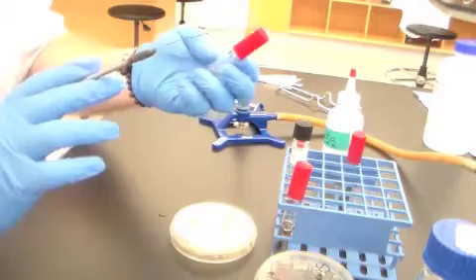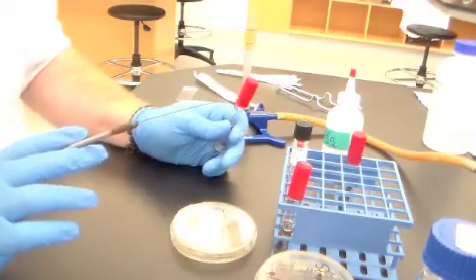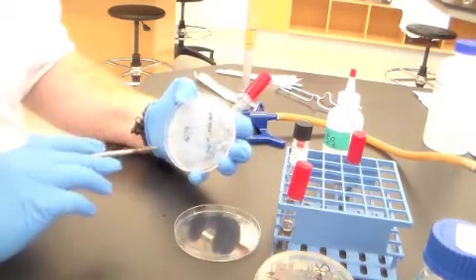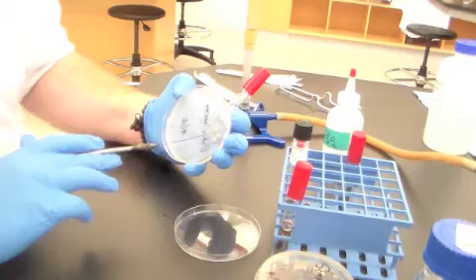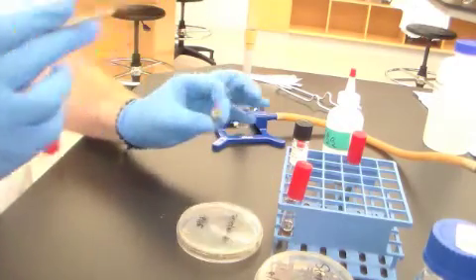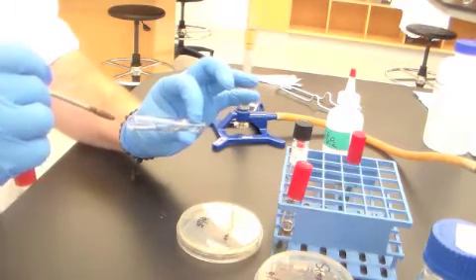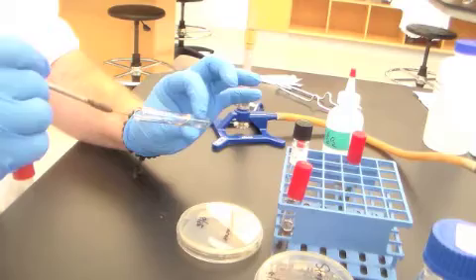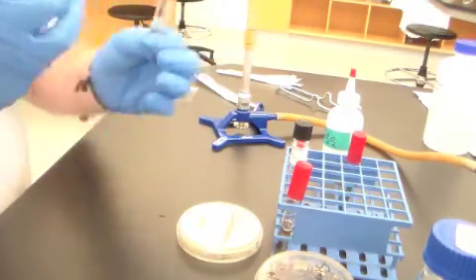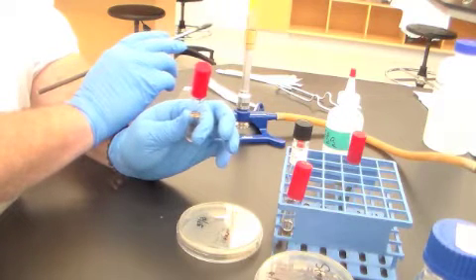Same thing with the indole broth. I'm not going to talk too much about the MRVP test or the indole test because next week for the pre-lab videos I'm going to show you how to complete these tests, because both the indole test, which I'm inoculating now, and the methyl red Voges Proskauer test require the addition of reagents after the bacteria have grown for 24 to 48 hours.